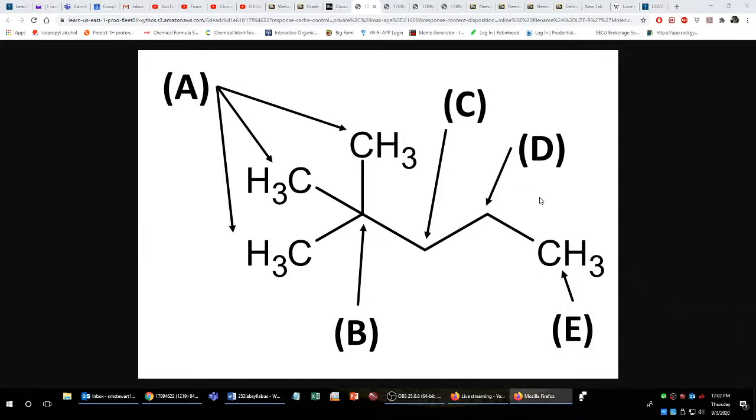Part of the reason you're getting this problem is to help you see how to identify it. What we expect to see here are 5 peaks because we have 5 carbons, A, B, C, D, and E. Now, what about the ratios? Well, we have 1 carbon that looks like E, 1 D, 1 C, 1 B, and 3 A's. The challenge with this one is going to be figuring out which carbon corresponds to which peak, the reason being that they're all going to have very similar chemical shifts. The A is easy to figure out. We have 3 carbons like this, so it's going to be the one that has a 3 to 1 ratio.